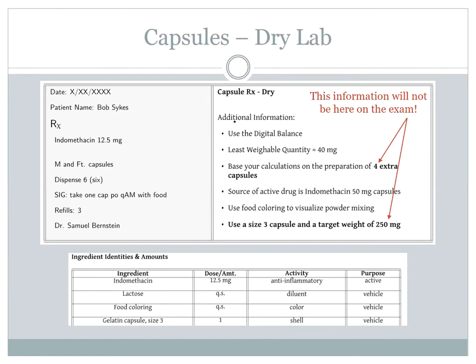We can't do that. More importantly, it's reasonable to give a low dose of indomethacin, which is a non-steroidal anti-inflammatory, or an NSAID. Think of it like an ibuprofen that's used for arthritis pain. But those medicines, all of those, are really rough on the stomach. So a geriatric patient who's at risk for a GI bleed may very well need a lower strength of this indomethacin to try to reduce the side effects. So preparing a low strength of indomethacin for him in a capsule that's not commercially available is very reasonable. So let's make this thing. So we're going to make it.